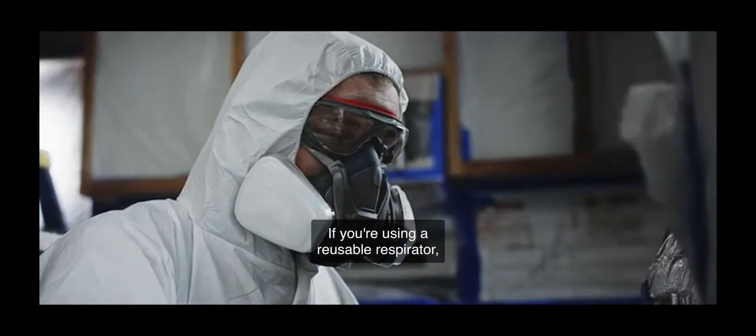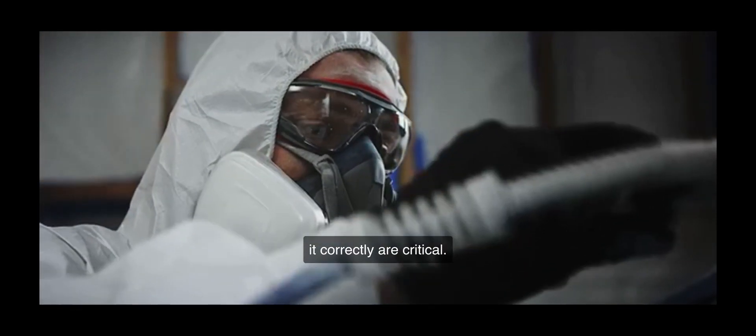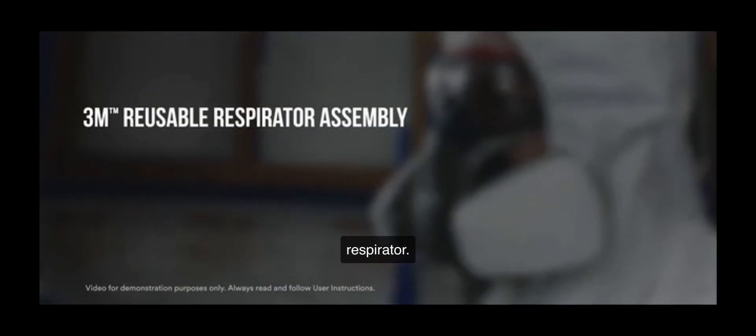If you are using a reusable respirator, following the user instructions closely and assembling it correctly are critical. Here's a demonstration for how to assemble a 3M reusable respirator.